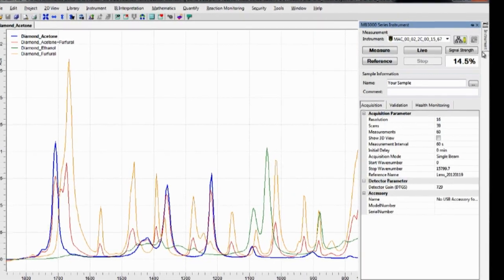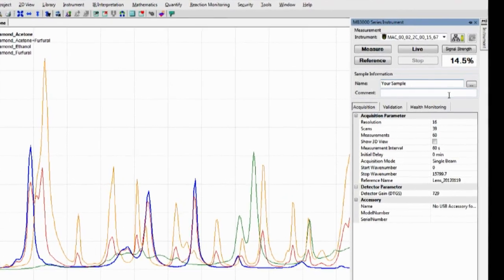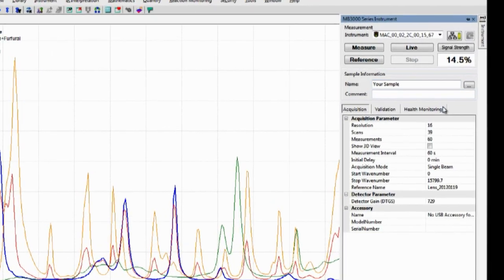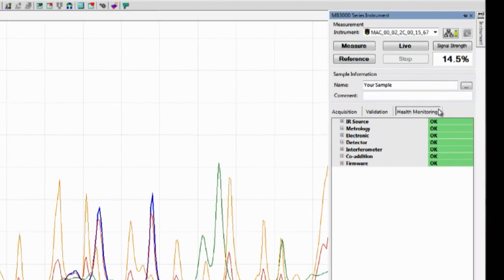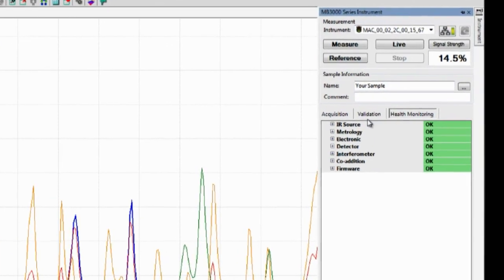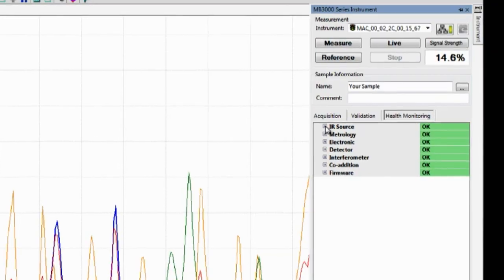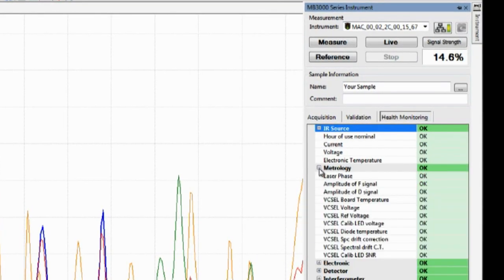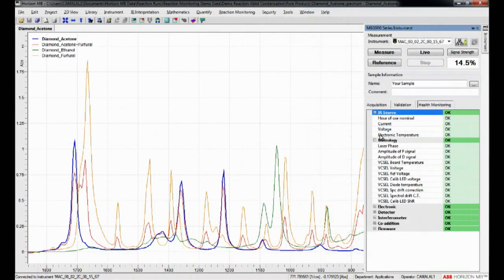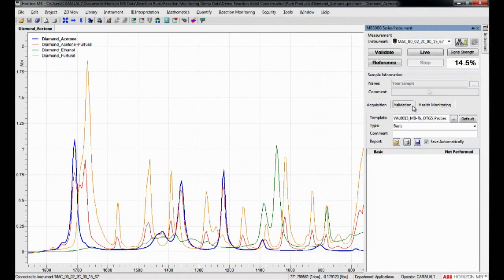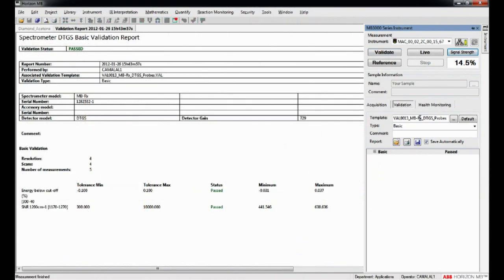The monitoring interface includes a complete set of internal instrument diagnostics that are accessible at any time. In addition, a sample validation can be performed on both the instrument and the probe in order to confirm that the system meets ABB strict tolerances.